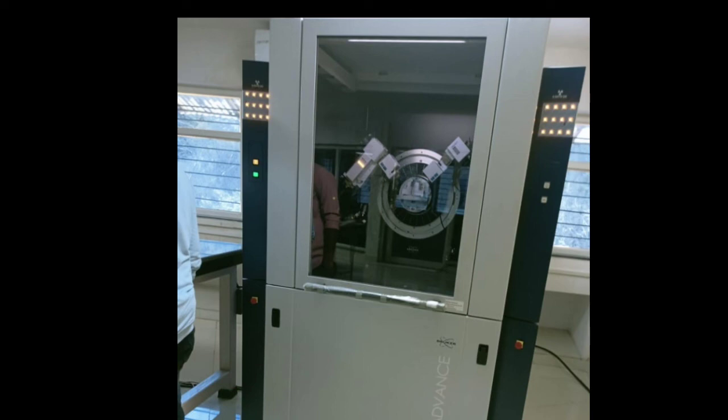the material. XRD works by irradiating a material with incident X-rays and then measuring the intensities and the scattering angles of the X-rays that leave the material. A primary use of XRD analysis is the identification of materials based on their diffraction pattern.